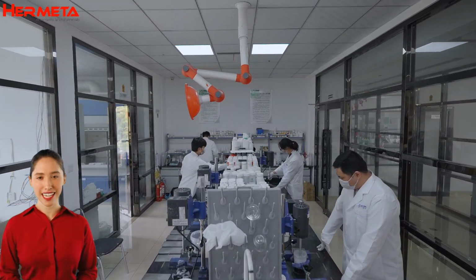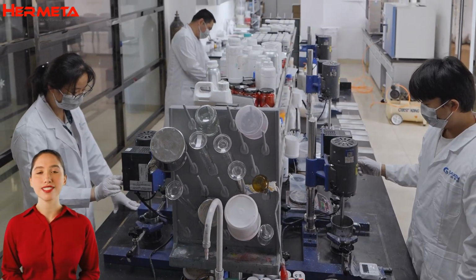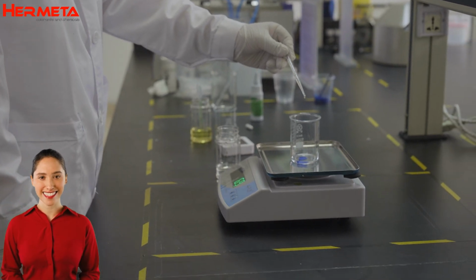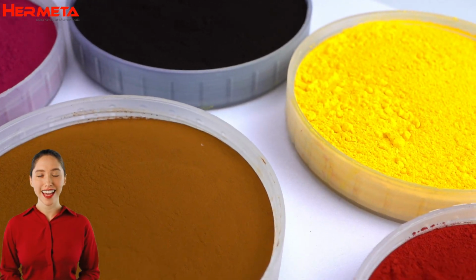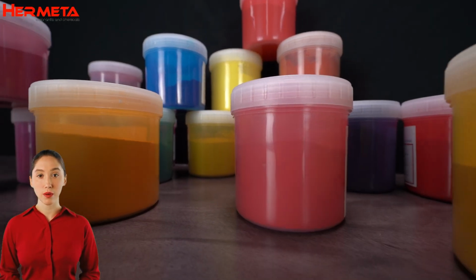Welcome to our laboratory, the cradle of organic pigments. We are committed to creating the best quality pigment products through precision testing and data analysis. Here, scientists work around the clock to break through technological bottlenecks and drive innovation, and are committed to providing high-quality additives and pigment solutions to the global market.